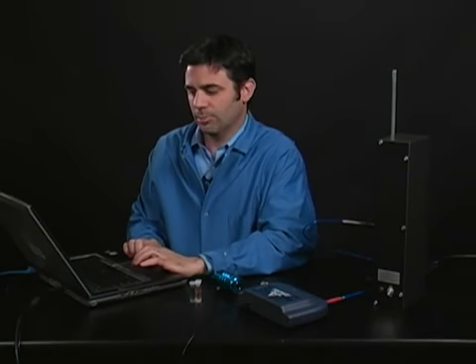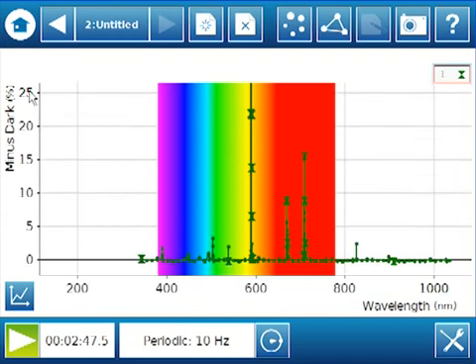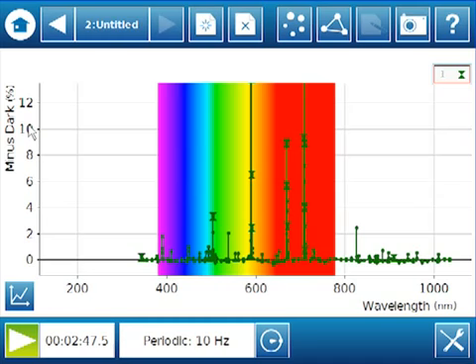And I'm actually going to look at the minus dark because I'm going to zoom in a little bit. There are a couple of big peaks that we definitely notice, but there are probably some other littler peaks that we don't notice right away. If you zoom in, you notice these other littler peaks that weren't as obvious when you were scaled out. So it gives you a good chance to look a little closer at the data.